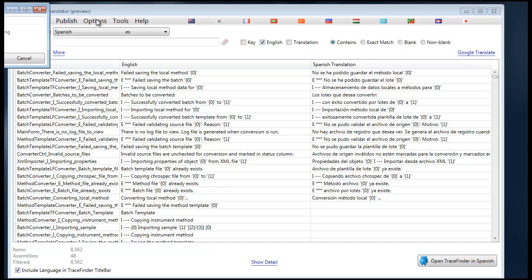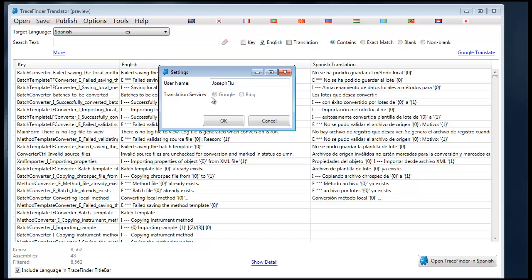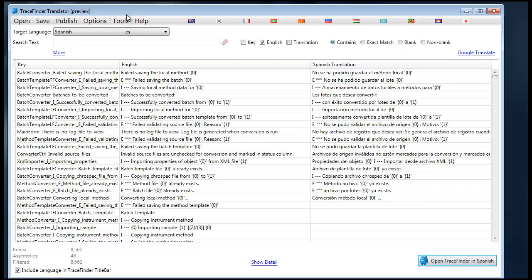The options menu allows you to choose your user name that you would like to be visible in the online store and the translation service. At this time, only Google translation service is available, but Bing will be made available at some time in the future as well. These settings are persisted and saved so that they will be available next time you open up TraceFinder Translator.